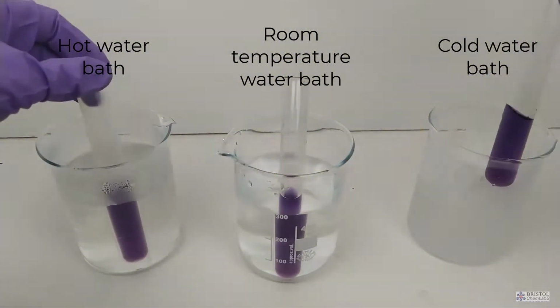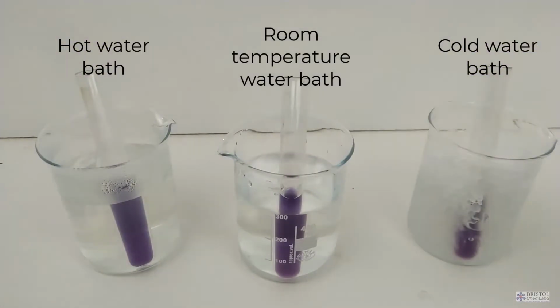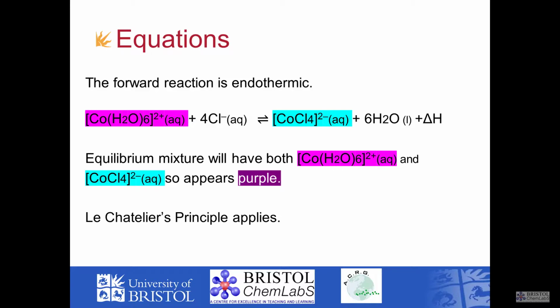We're not bothered by the H+. They are merely spectator ions. Let's look at the equation. Firstly, note the equilibrium sign, and secondly, notice there is a positive delta H on the equation. This means that the reaction left to right takes in energy.